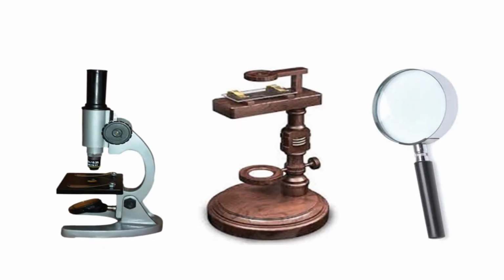These are also varieties of simple microscope. We have the magnifying glass, that is a simple microscope. Then we have this microscope here. This contains a single lens. So that is it.